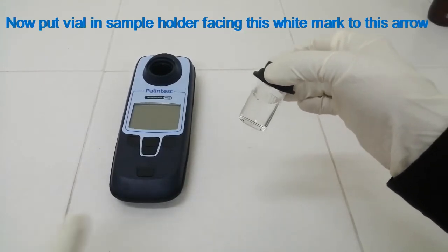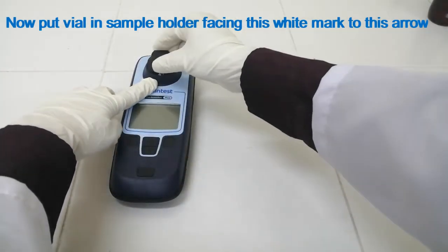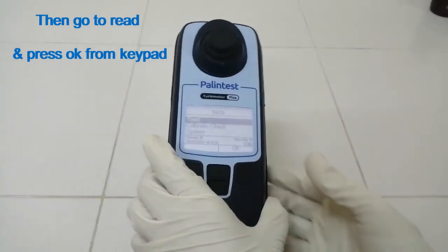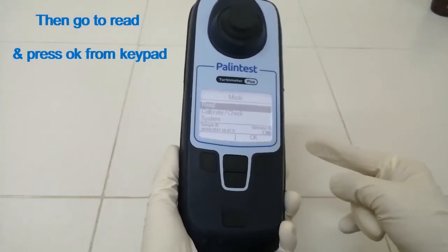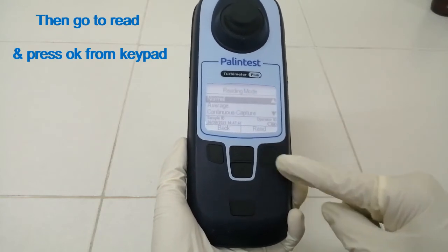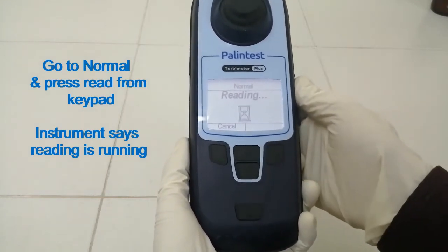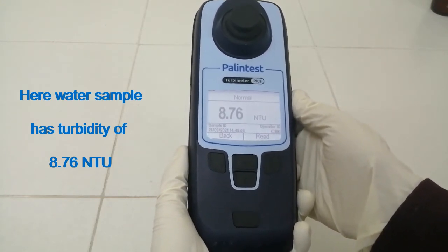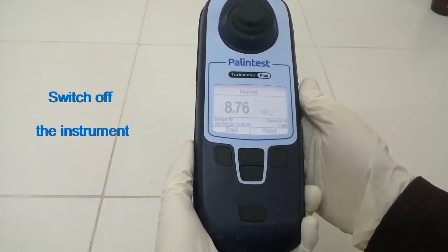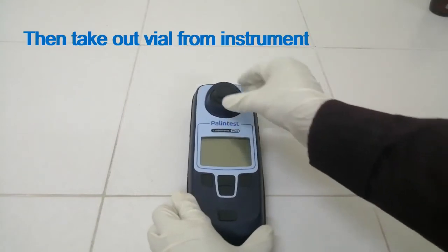Put the vial in the sample holder facing the white mark to the arrow. Switch on the instrument, then go to Read and press OK from the keypad. Go to Normal and press Read from the keypad. The instrument says reading is running. The water sample has a turbidity of 8.76 NTU. Take out the vial from the instrument and switch off the instrument.